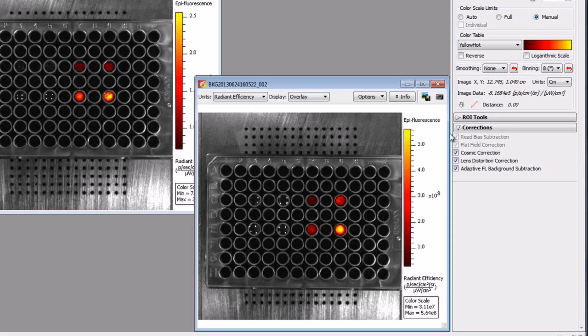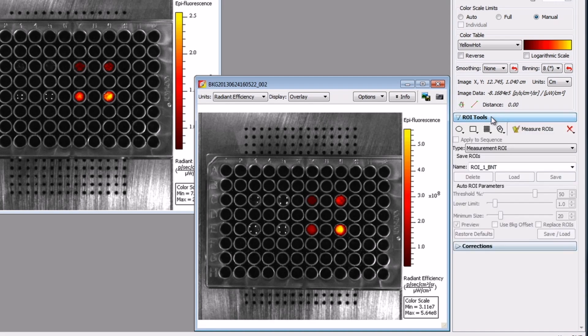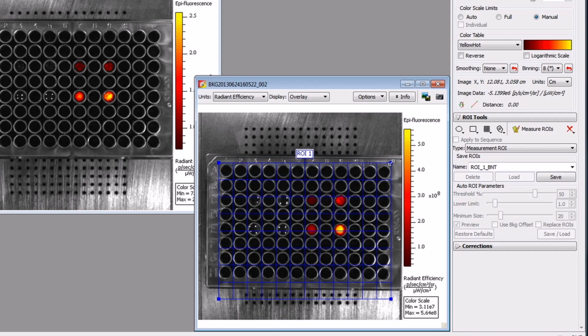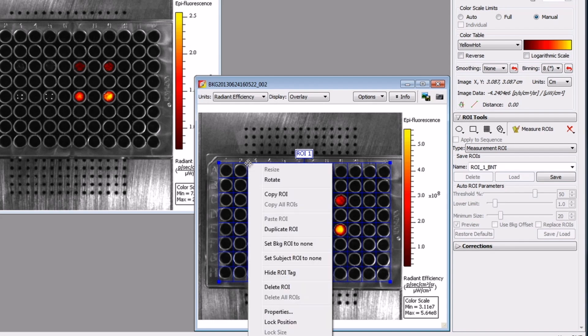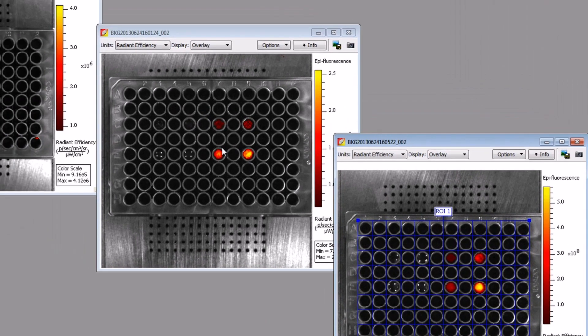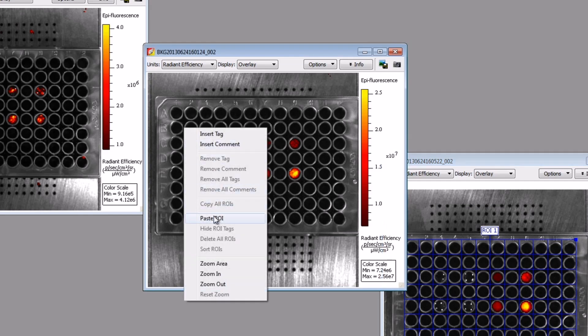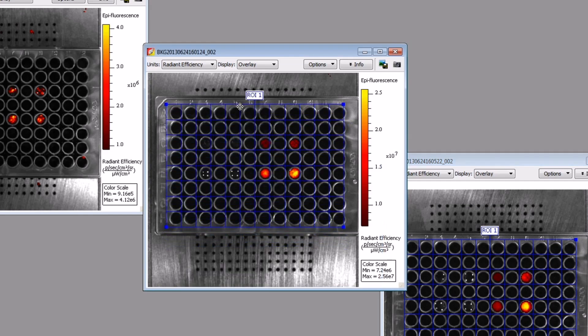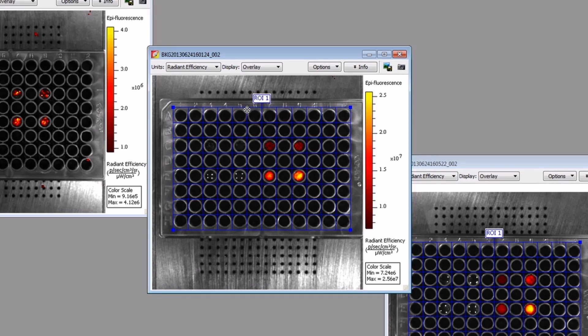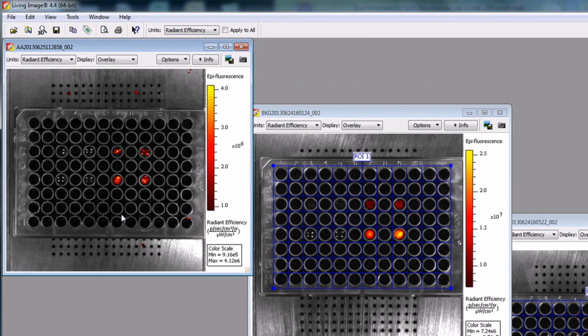As previously discussed, we will define a region of interest or ROI by drawing a grid measurement ROI on our image. Access the ROI drawing tools in the tool palette. Repeat the adaptive fluorescence background correction and placement of a grid ROI for each image acquired. In this case, I will right-click on the ROI and select Copy ROI from the menu. In the new images, I will right-click and select Paste ROI. If the well plate is slightly crooked, you can right-click on the perimeter of the ROI and select Rotate to adjust the ROI.